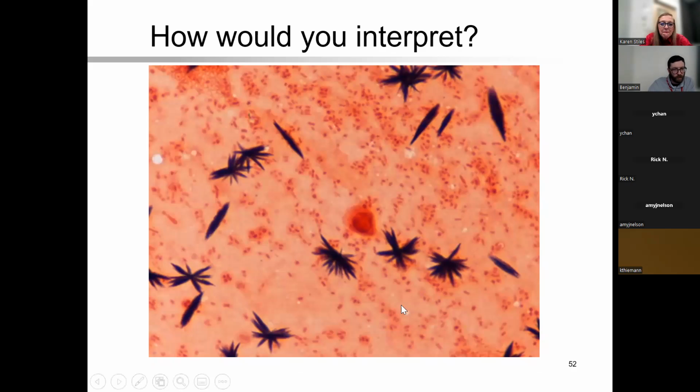This here is a little trickier. So here we have some precipitate. These things here, we're not going to pay attention to. These here, this is Haemophilus, our gram-negative coccobacilli, these little ones in here. It looks like there are some regular gram-negatives in here too. What we're looking for here is the good stain on this. If this had been a lighter stain, it might be really hard to pick out.